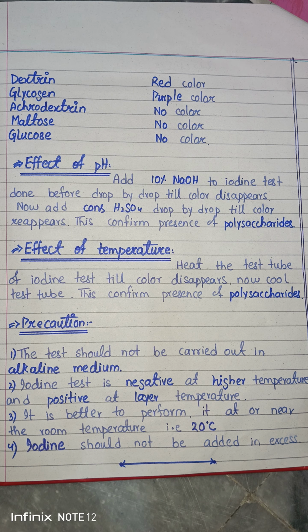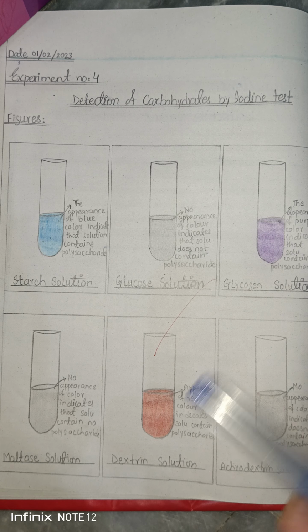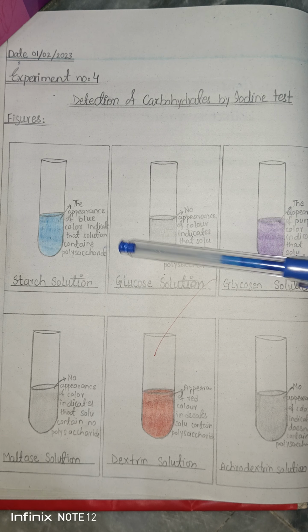So now I will explain the whole diagram, the whole procedure, and how these colors appear. This is the representative diagram of this experiment, and it will explain all the procedure to you. So in this diagram you will see this figure.